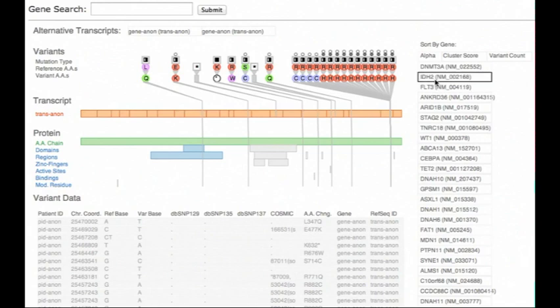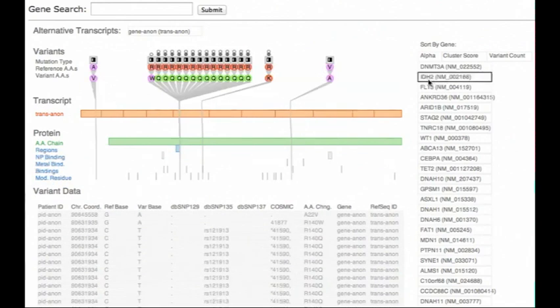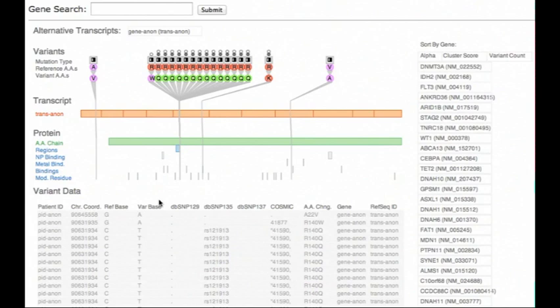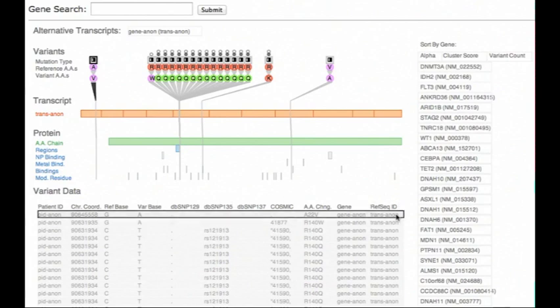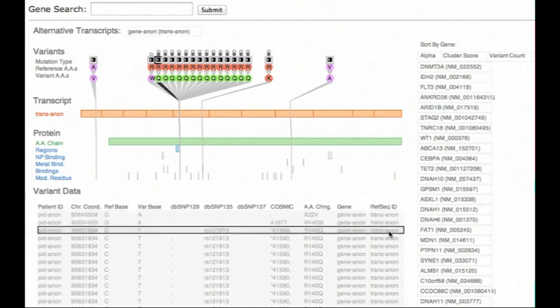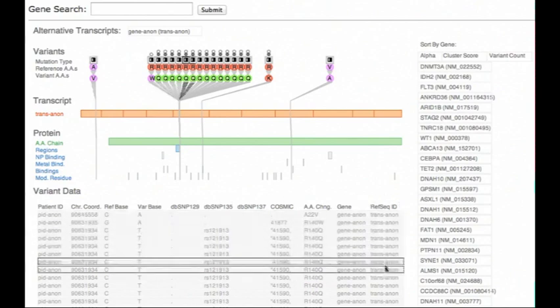Information that peripherally supports variant analysis is accessible in a detailed table view at the bottom of the display that is bidirectionally linked with the main view on top.